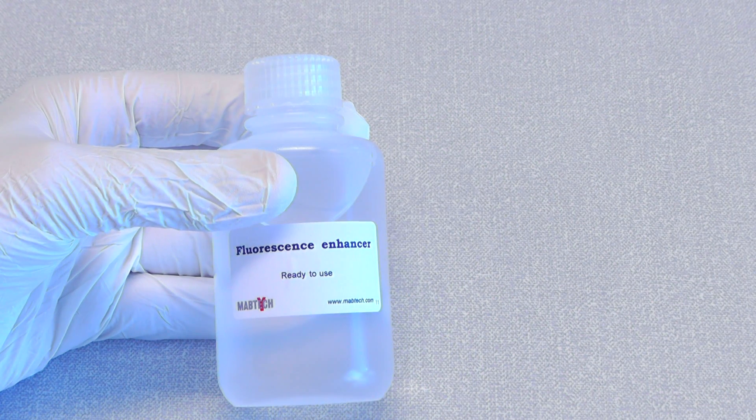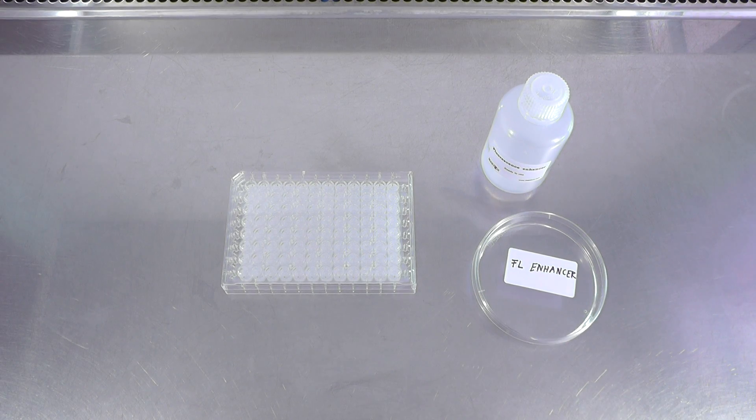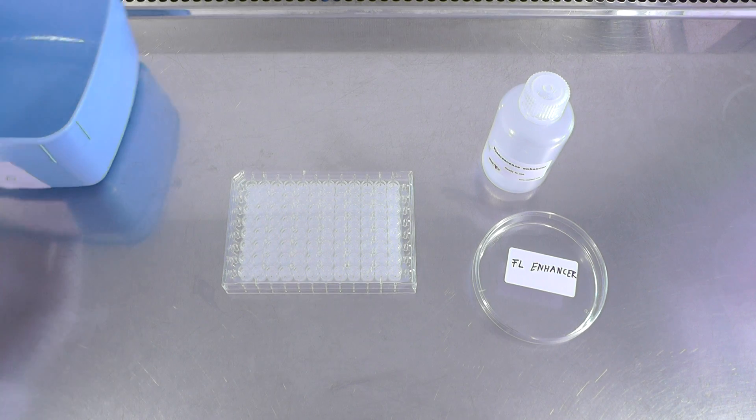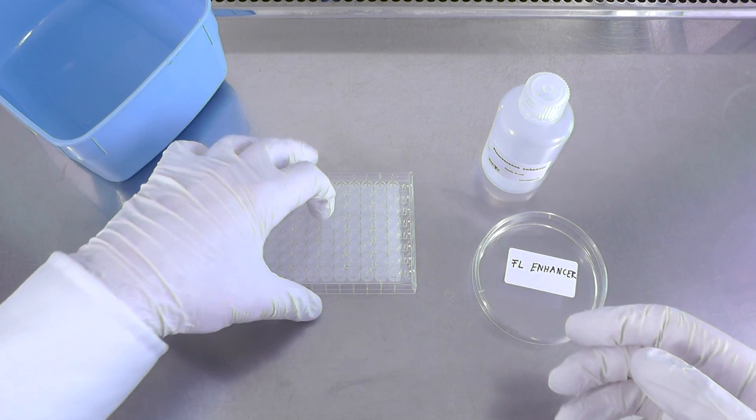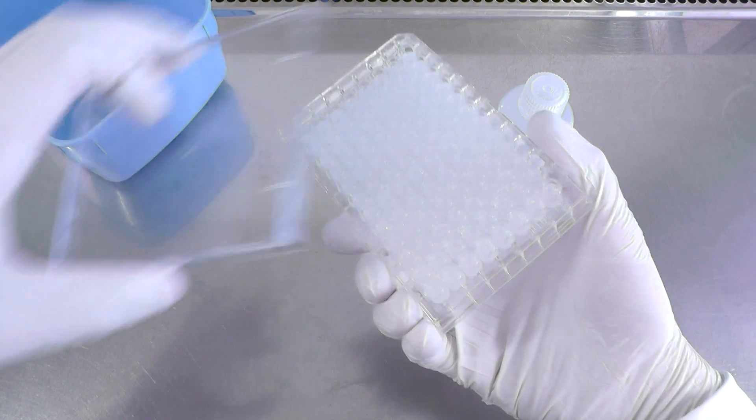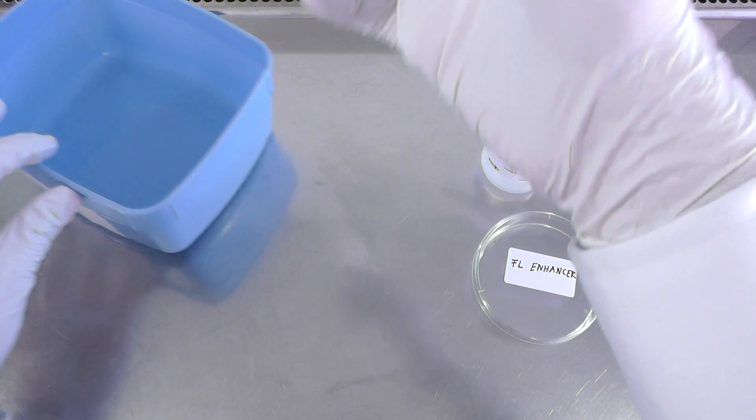The fluorescence enhancer solution is a critical component in the fluorospot assay that works just as its name implies. It enhances the intensity of fluorescent spots. The enhancer is added as a final step before the plate is dried and ready for analysis.